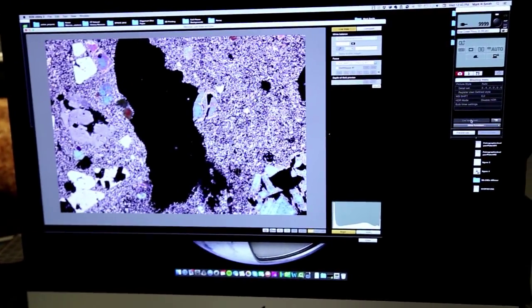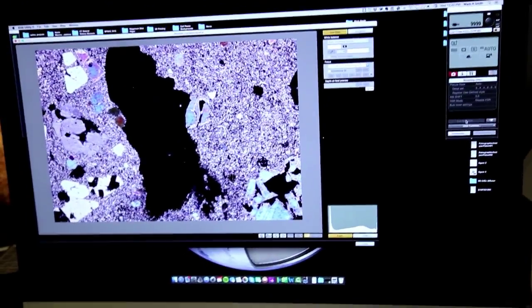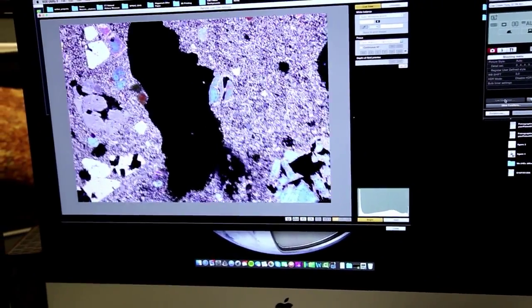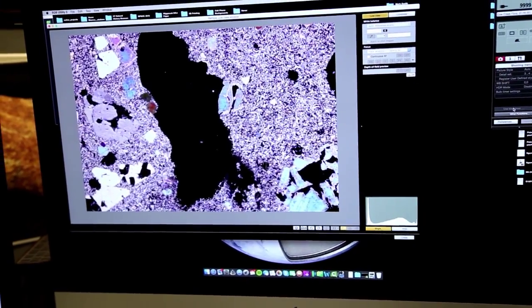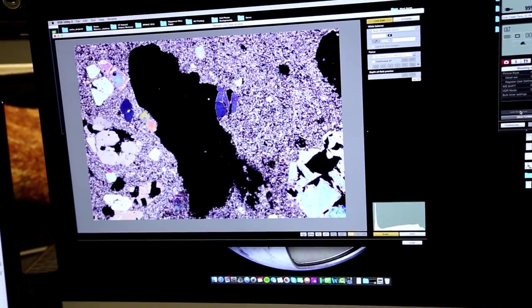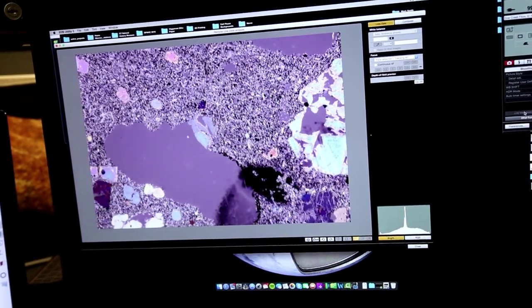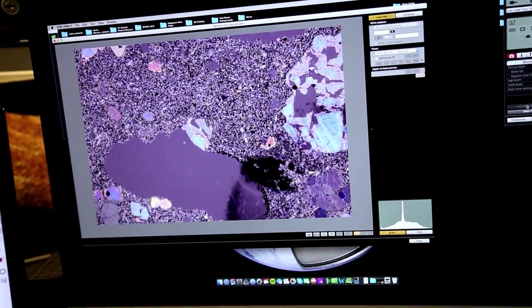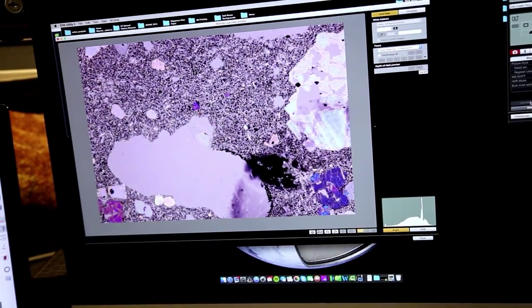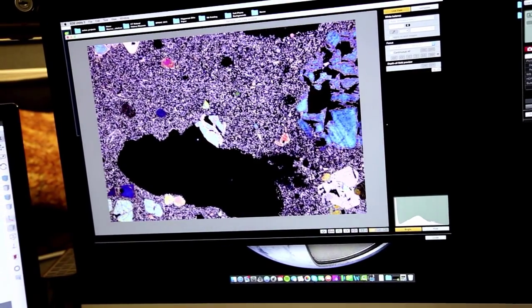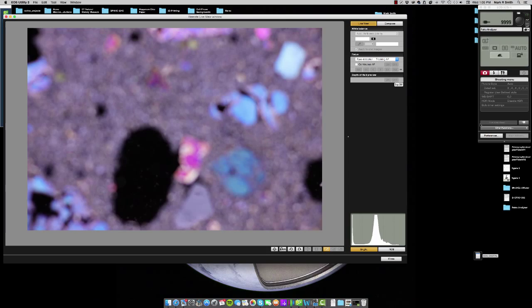I can also rotate the analyzer, which is on the petrographic analyzer itself. It's really nice and handy having this live view function for the fact that you can move the slide around and view it in plain and polarized light.